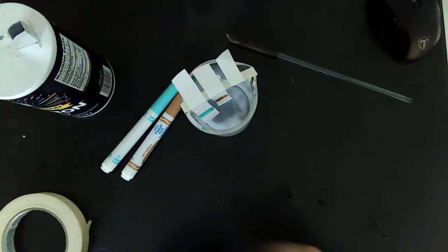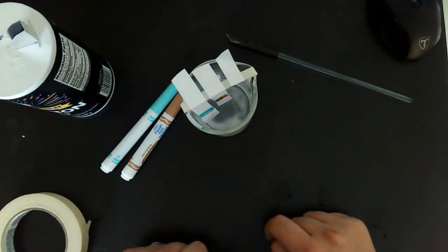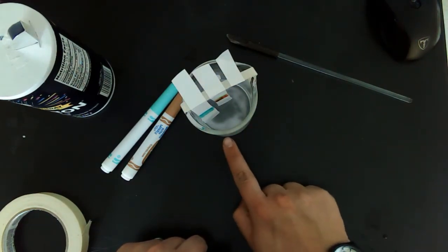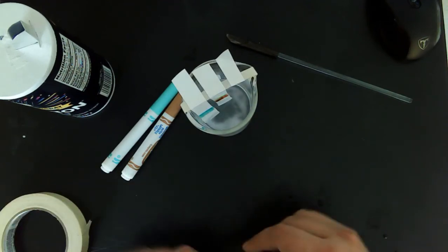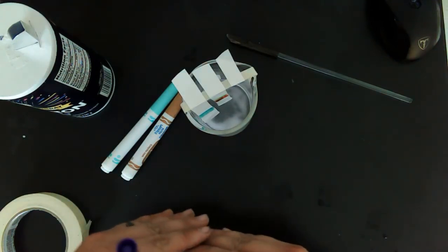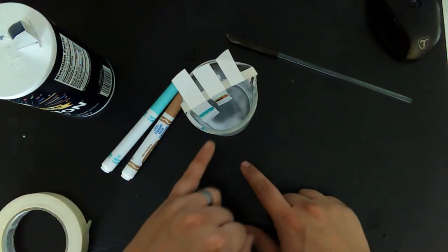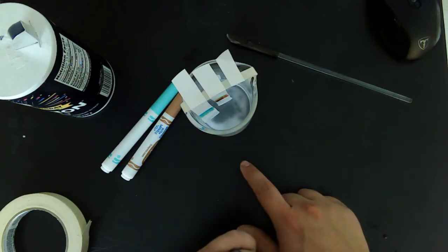Alrighty, after some finagling, I was able to get all three of those across, and the solution is not above that marker level. We're going to wait about 15 minutes in total to give that solution plenty of time to move up. As you can barely see, this middle brown right here is starting to not look like brown anymore.